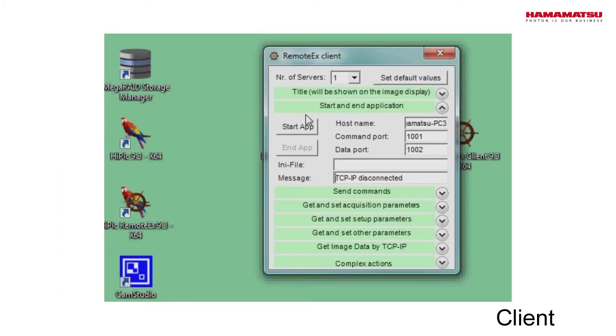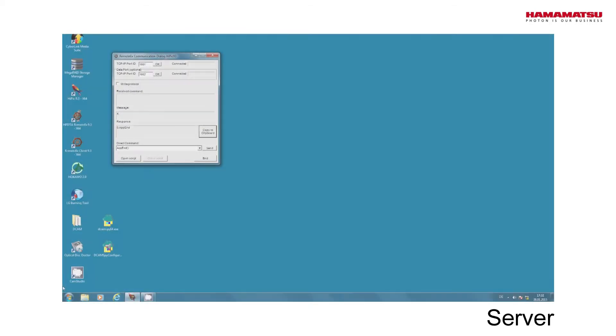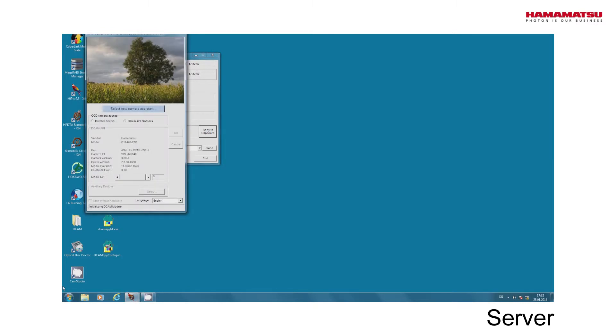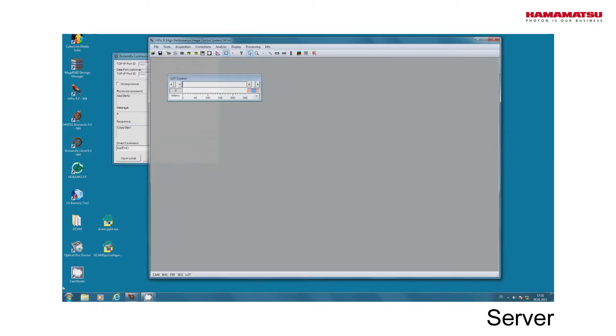To start the application, we click Start App on the client computer and can see that the application starts on the server.